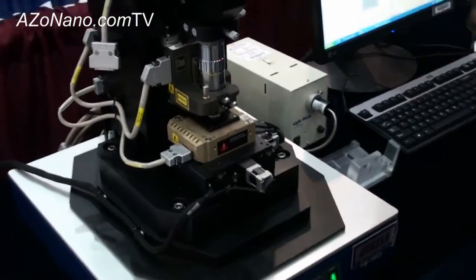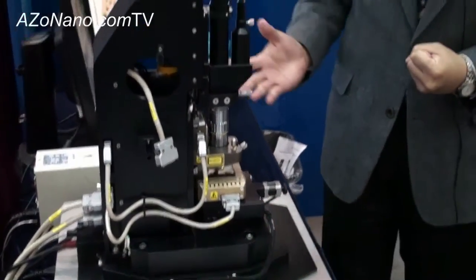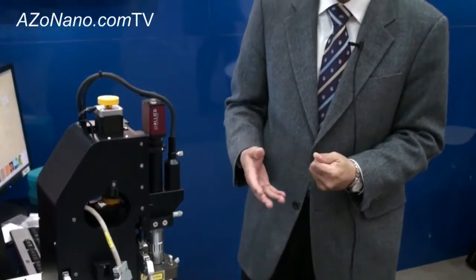This AFM is truly a new generation AFM. It can produce much more accurate imaging, higher resolution imaging, and is easier to use.